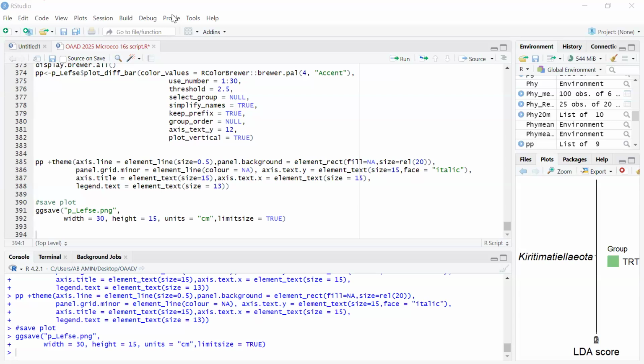And it works with the Greengenes database, which is a database for 16S rRNA sequences and bacterial taxonomy, or the Silva database. So that's where it's done, using the QIIME software.